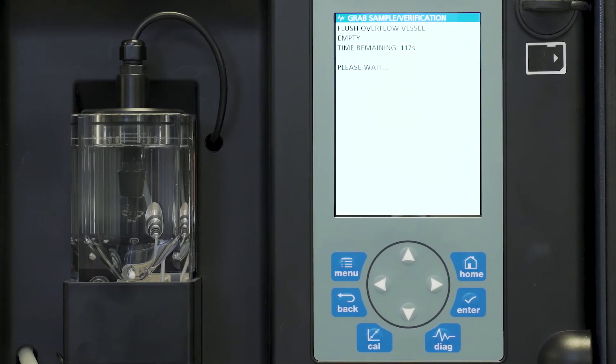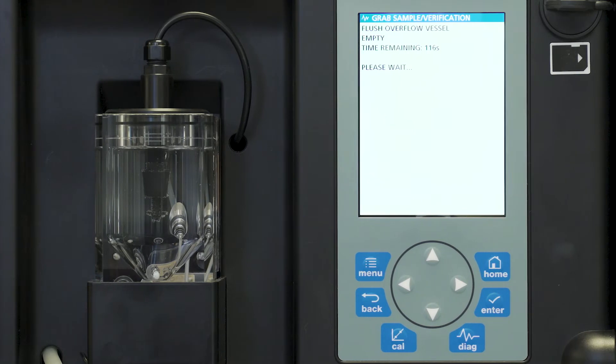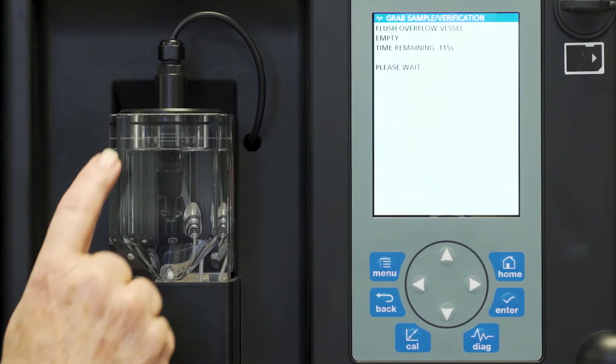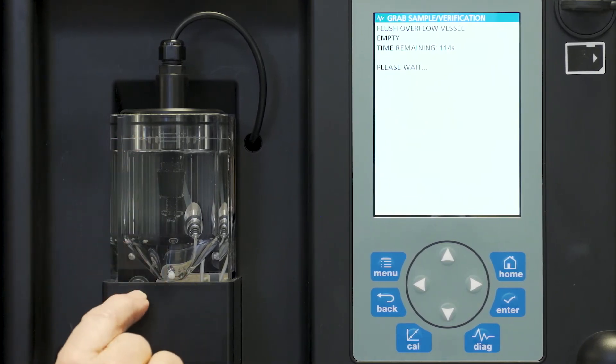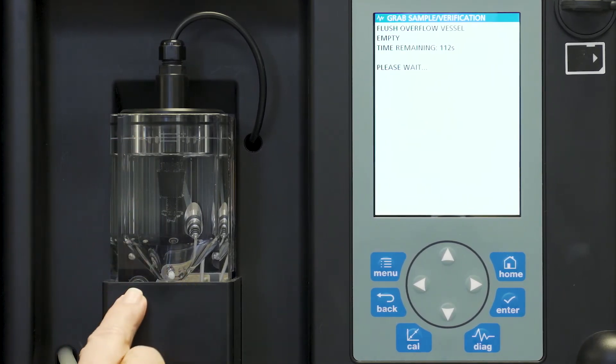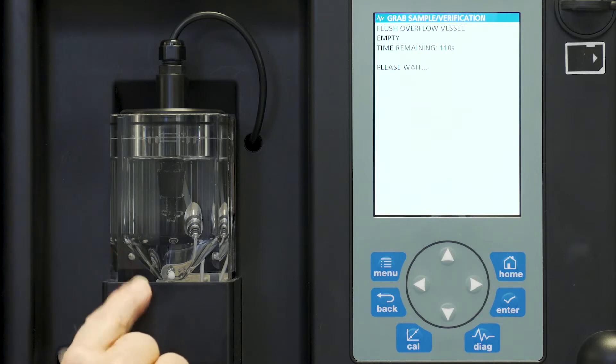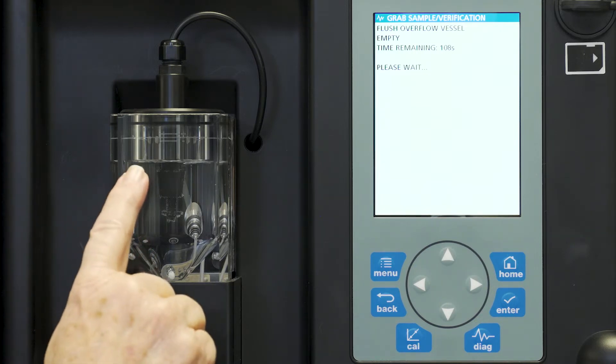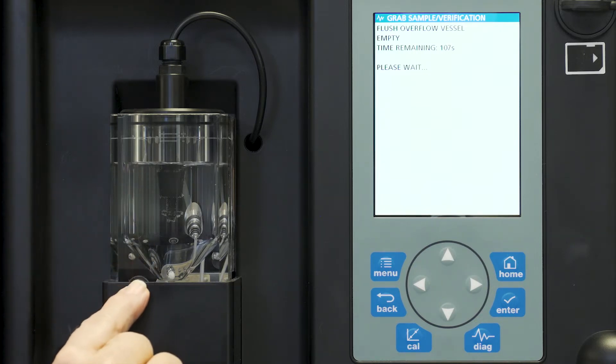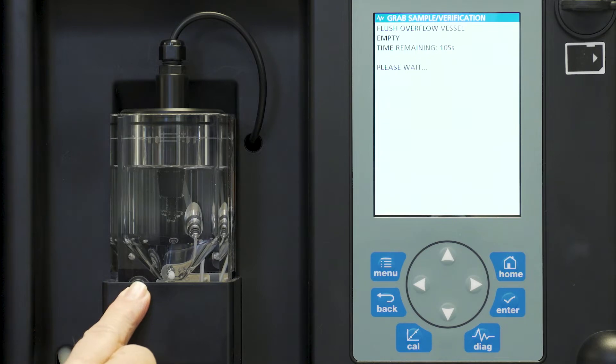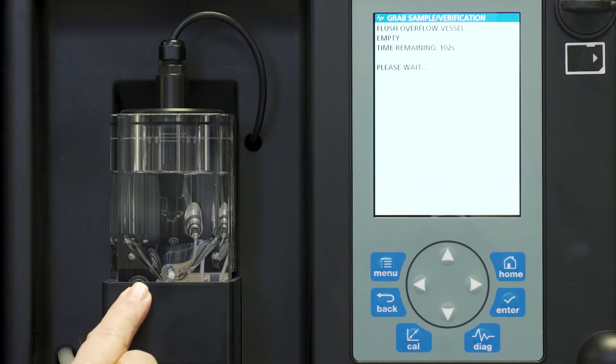What is happening right now is that we're flushing the overflow cell with our current sample. It's going to go through a complete flush here, refill, and do another flush. At that point in time we will go directly to adding our grab sample.